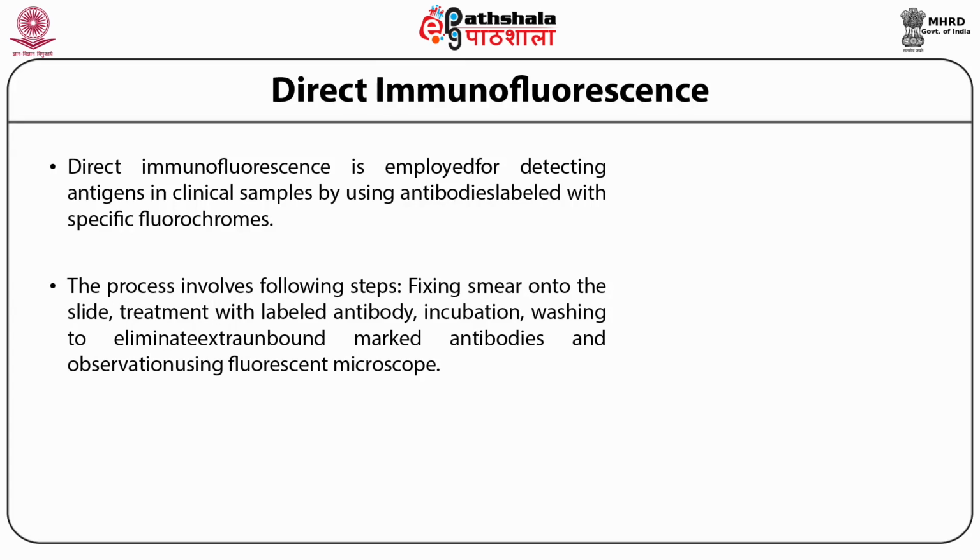Then, the treatment with labeled antibody, followed by the incubation, then the washing to eliminate extra unbound marked antibodies, and finally the observation using fluorescent microscope.